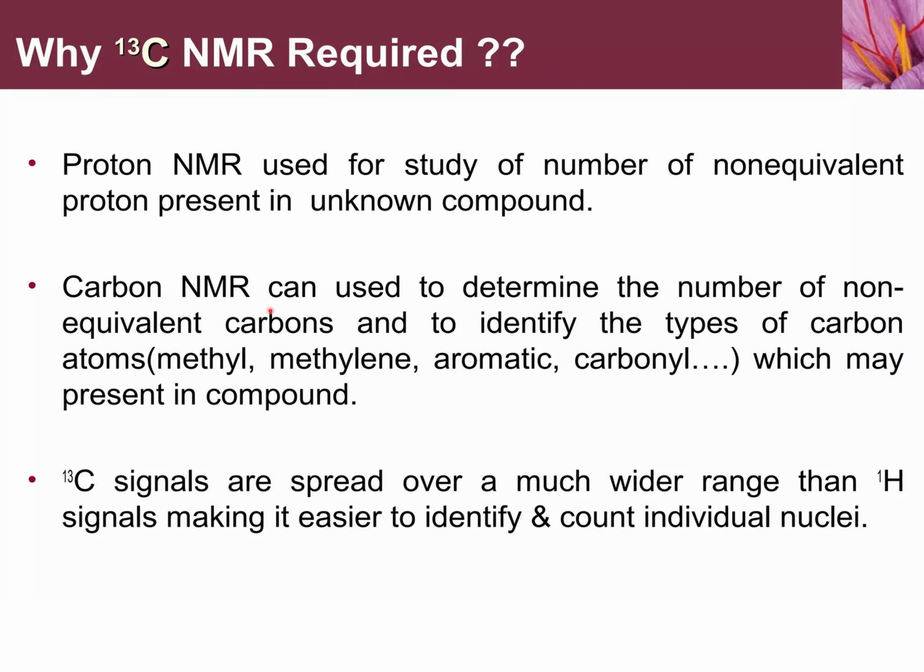Moreover, in proton NMR we have integration of different peaks, and splitting also occurs. But in carbon NMR only one sharp peak is observed for each carbon, and hence your elucidation is better.